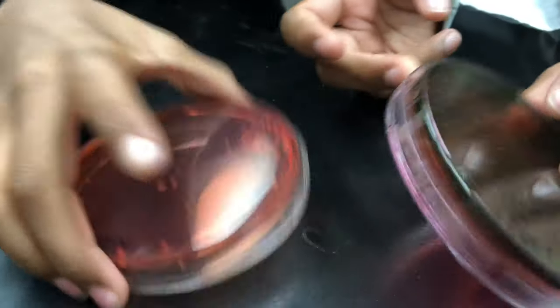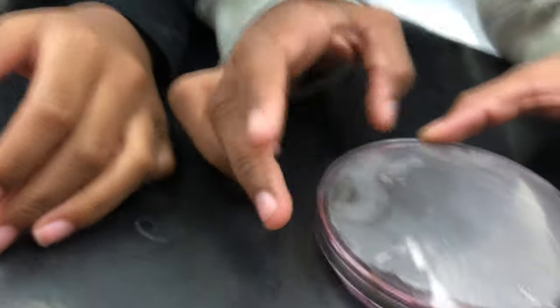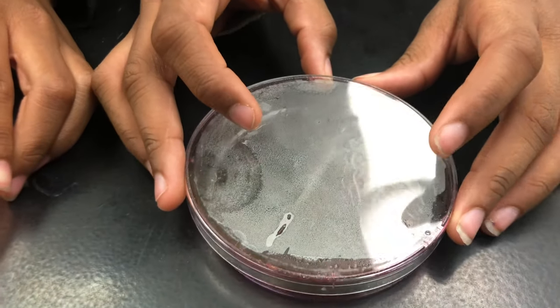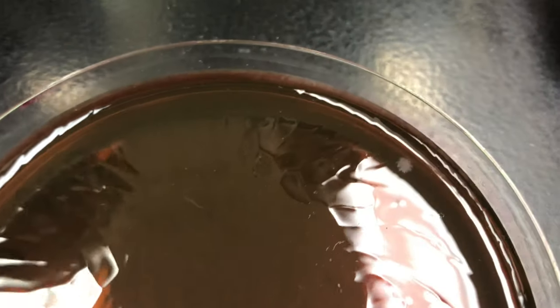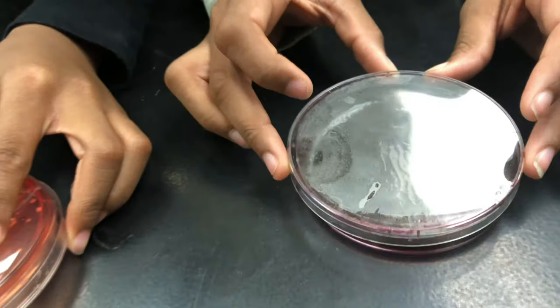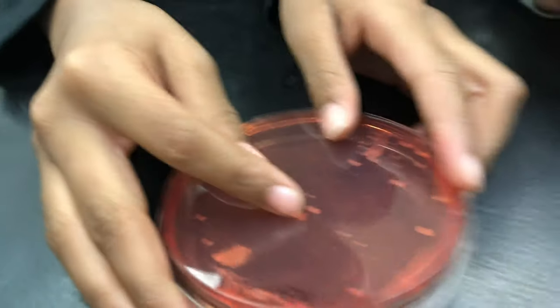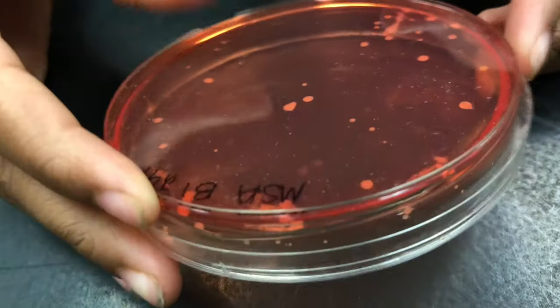I was saying I don't think there's going to be any. Let's flip it over and open it — I'll do the EMB agar first, since that's the one that grows fecal bacteria. Let's open it and see what it looks like. I don't really see much... I see a little fungus there but that's expected. I don't really see much on this, so the article said fecal bacteria but I guess this one didn't blow any.